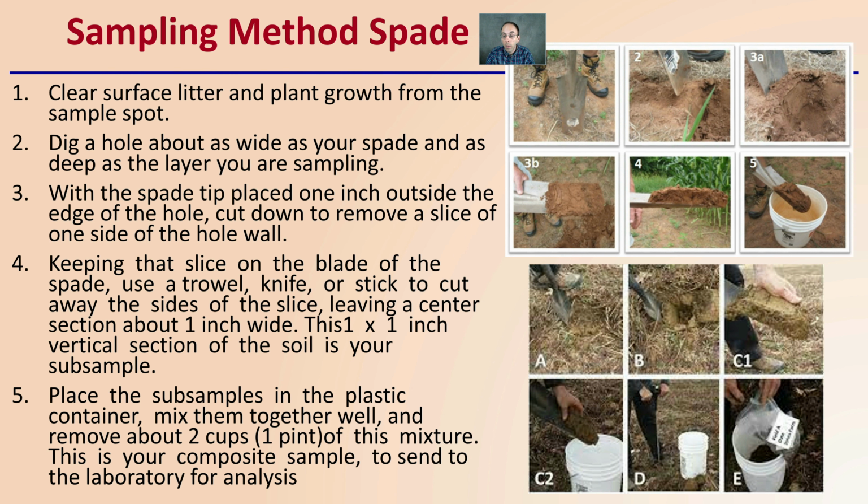And there are 2 main methods. One is the soil core method. So in this example, I've got an actual soil core. This is probably the easiest way. If you're going to be doing a lot of samples, this is by far the way I would recommend. You're going to take your soil core. This area here is about 6 to 9 inches depth, which is what you want. The reason you want it to be that deep is that it is basically the root profile.